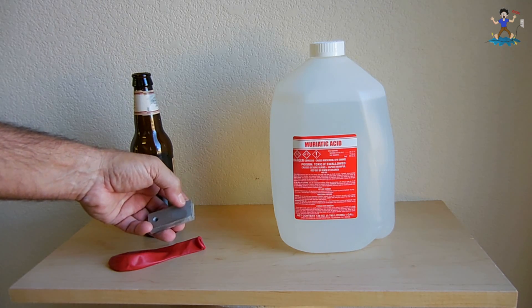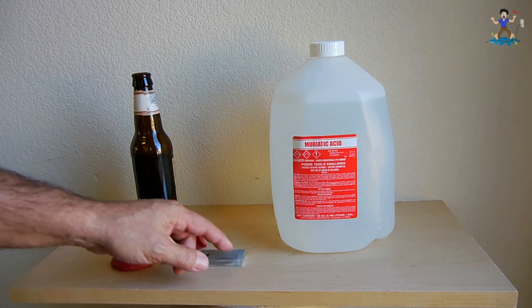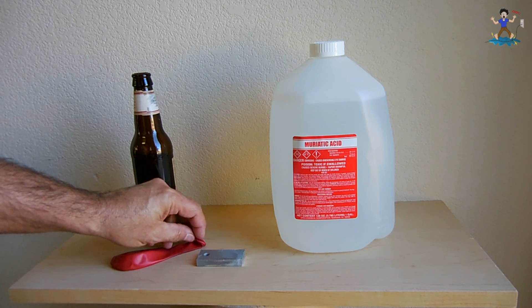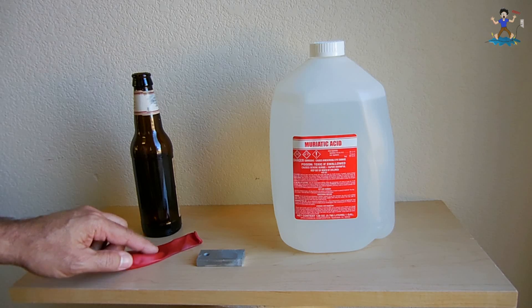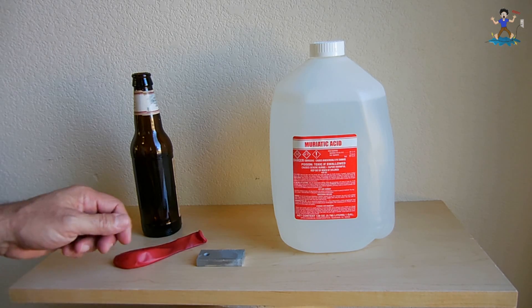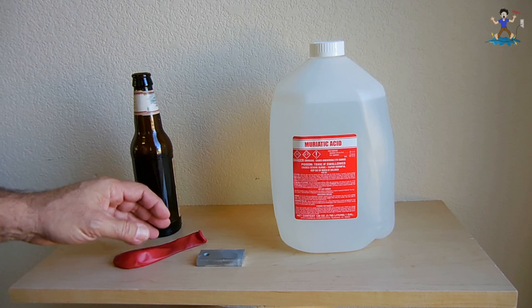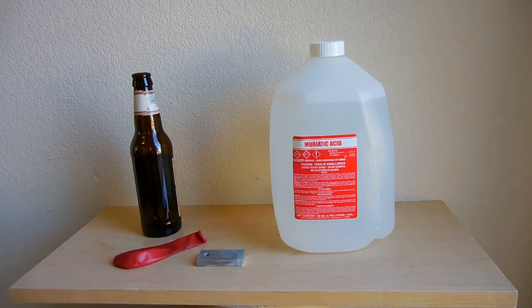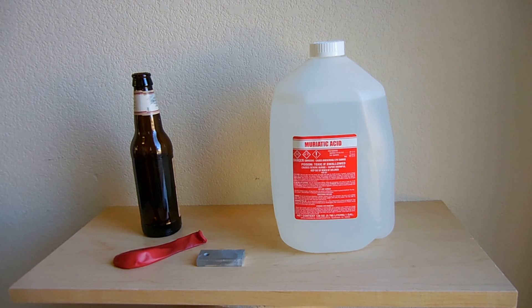Then I'm going to take a chunk off of this igniter using a hacksaw — maybe three-eighths of an inch in length from this end to here. We're going to take that piece, drop it inside the bottle with the acid, take the balloon, and put the balloon on top after it's been stretched. You want to inflate it a few times, stretch it out, make it nice and loose so the gas can go into the balloon easily. Once the balloon is on top, place it inside the bath of cool water. Wait about 10 minutes, the balloon will be full of gas — pop it off and tie a knot.